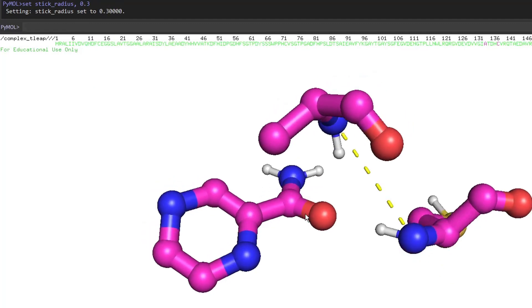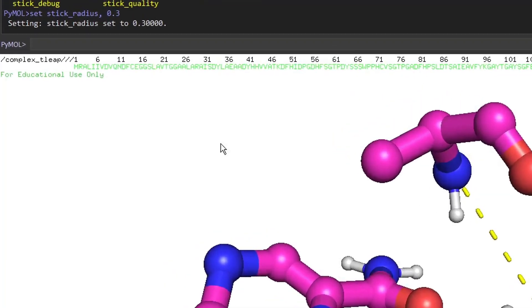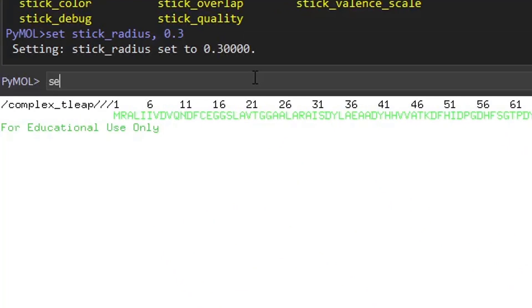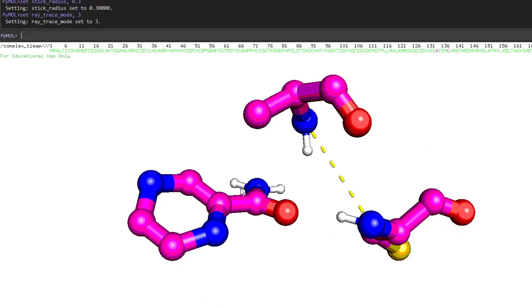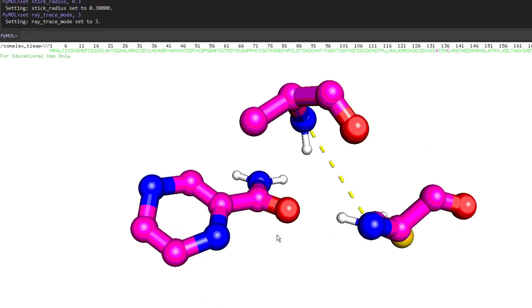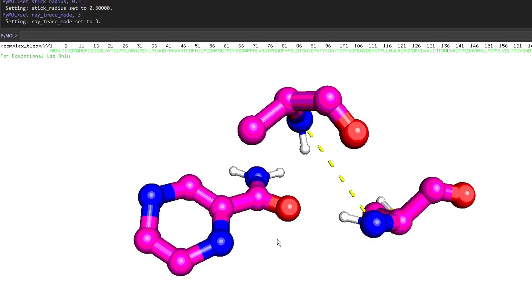The last thing — we will type the command: set ray_trace_mode, 3. Now we have the final rendered picture ready.